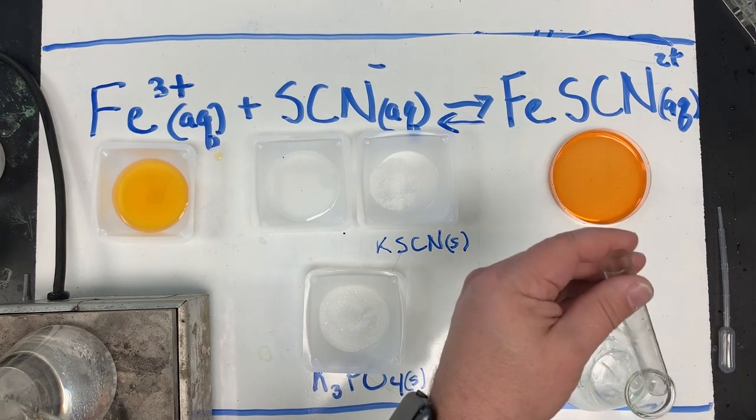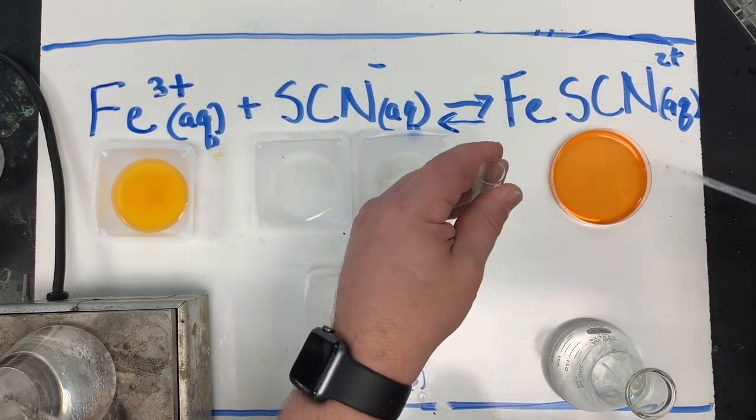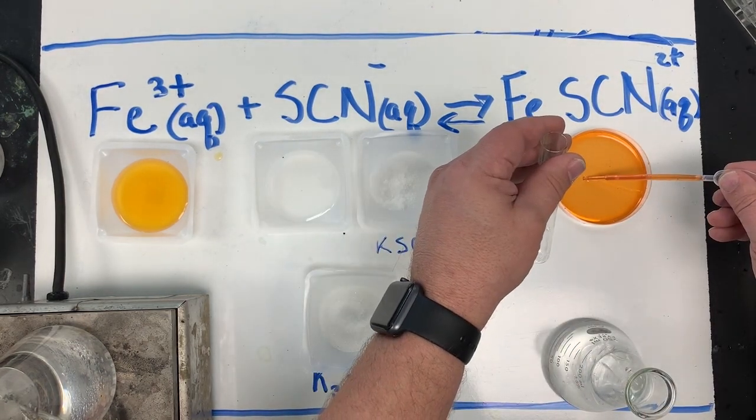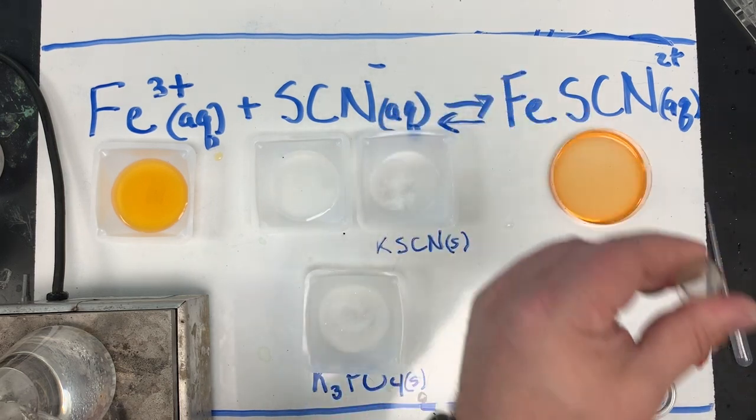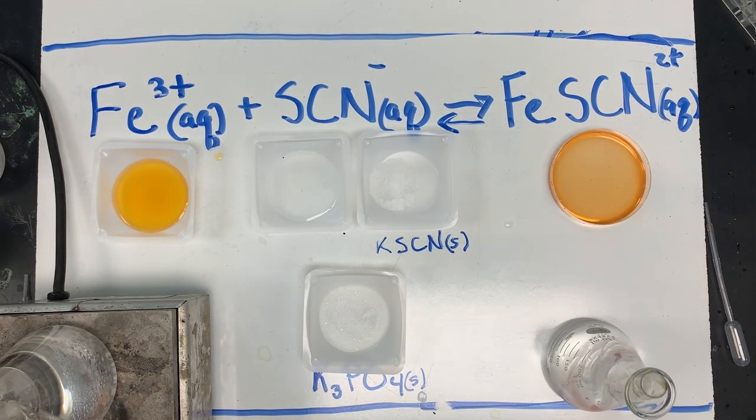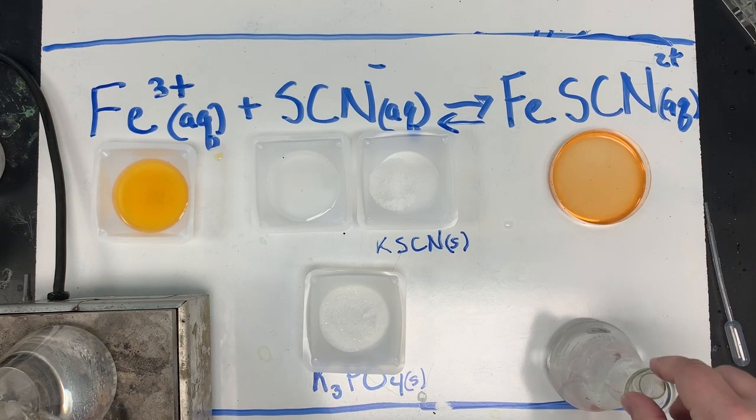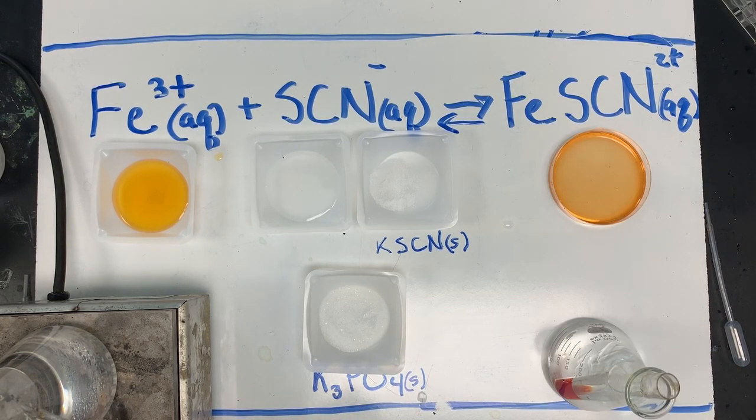Here I have a test tube. And I'm going to add another five milliliters. And I'm going to let this sit in a cold bath. And after it has sat for a while, we'll take a look and see what happens when heat is added and what happens when heat is taken away. We'll let it sit for about three minutes.